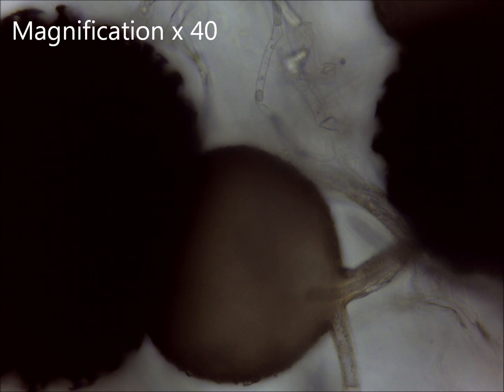Actually, the spores are quite big, but it's quite useful to go to times 40 if you want to look at a particular feature. For example, here you can see the fine suspending hyphae going into the gametangia and out again.